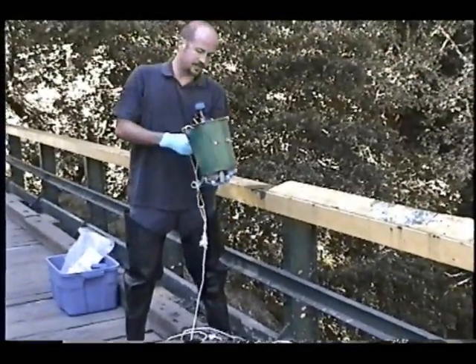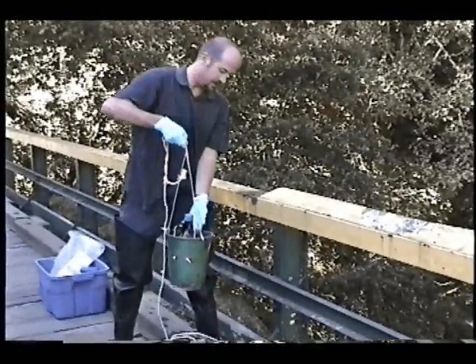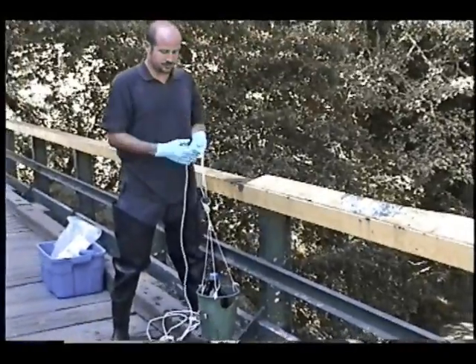One thing you want to note is that you are collecting a small amount of surface water in this sample, because you're entering and exiting the water coming up through the surface.